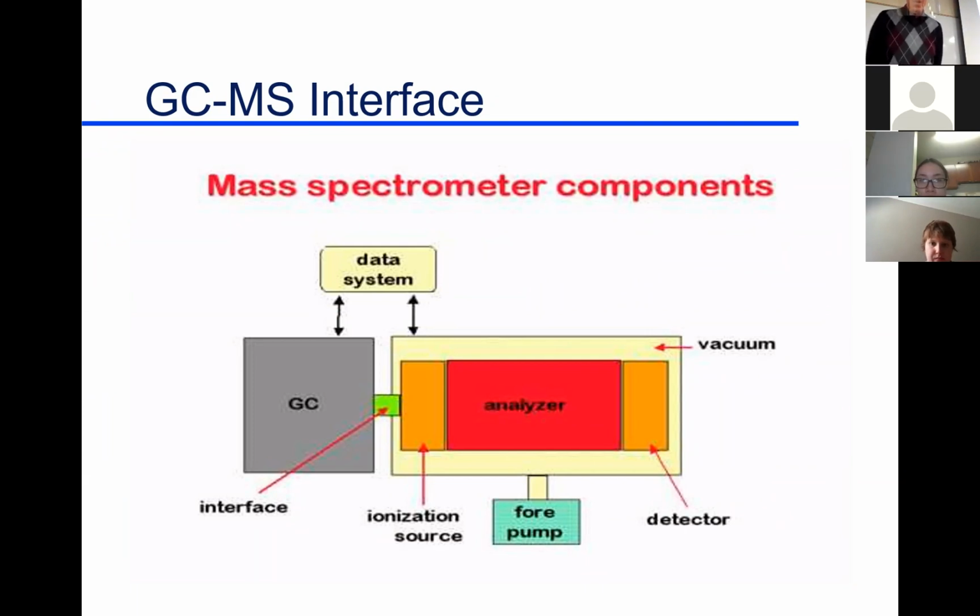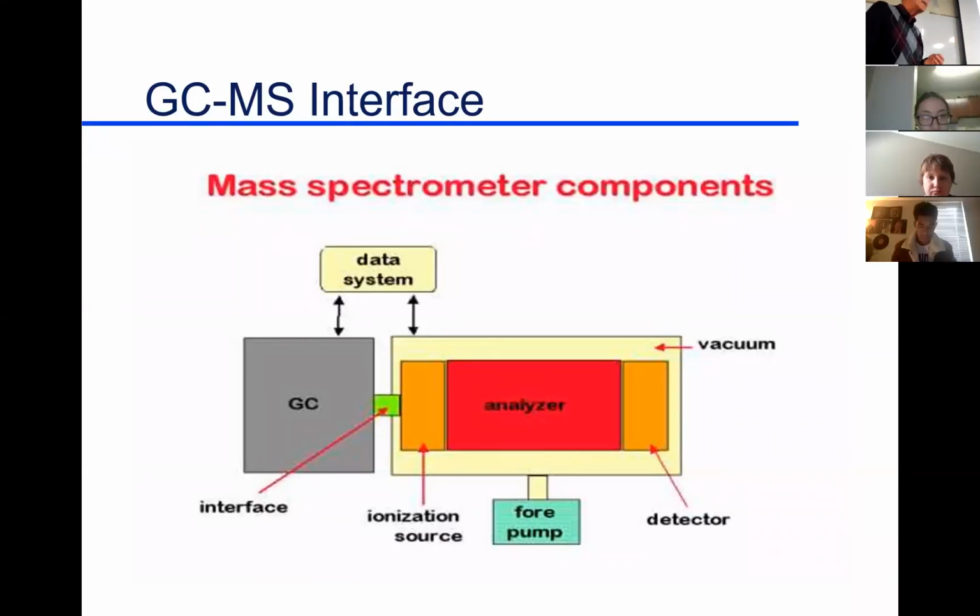Okay. Good. Well, we're getting back to mass spectrometry at this point. We talked a little bit about different sources of ionization, how we blow a molecule apart, where we get the energy from that. A little bit about how we separate these fragments, these bits and pieces that the molecule's been blown into, and how we measure them. So we kind of got the parts of a mass spectrometer.